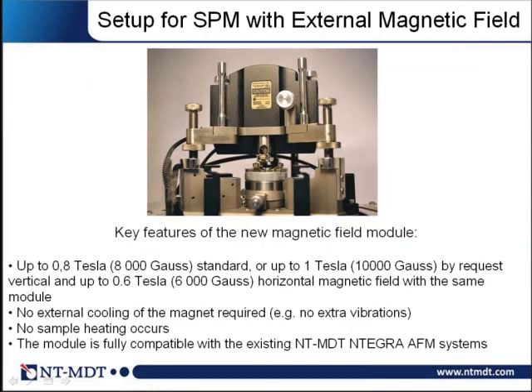As you see in the previous slide, quite strong magnetic fields are necessary in many cases. And therefore, I'd like to say a few words about a recent development of NT-MDT, a device or setup for applying rather strong magnetic field, which has been developed, because I was one of the co-authors of this device, so I'd like to say a few words about that.